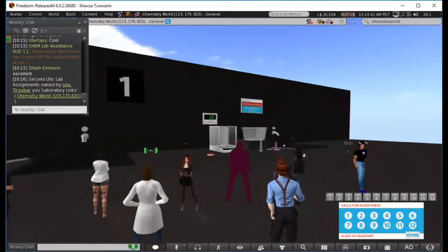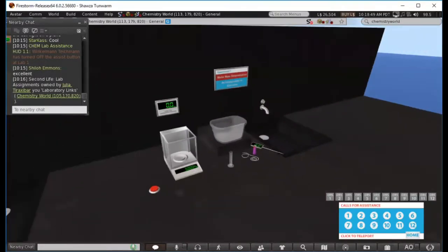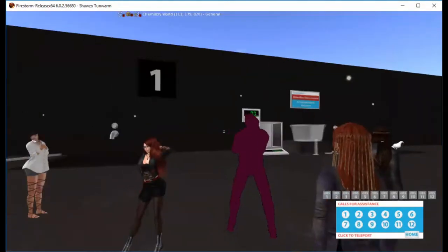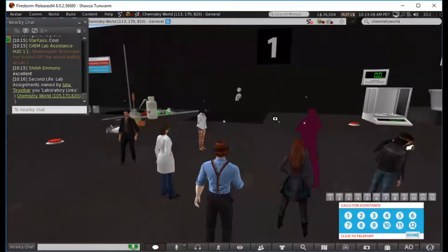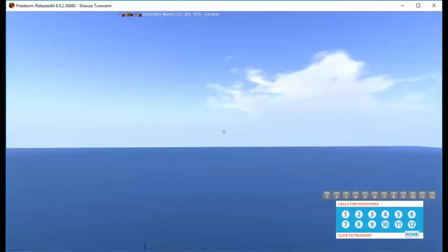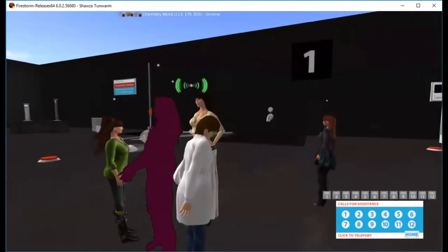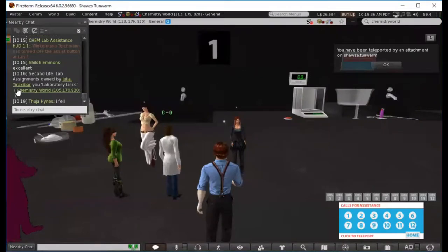One other feature of the HUD that I'll show you is, there are 12 lab stations, and we're on lab station number one. We got here using the blue and white portion of the HUD. Above that are 12 buttons labeled 1 through 12. If you click on button number one at the top of the HUD, the gray button, go ahead and do that and see where you end up. Just to let you know, they are on the other side of that black background. It's a one-way wall, and this was used so that we could observe what the students were doing without them feeling like they were being watched.